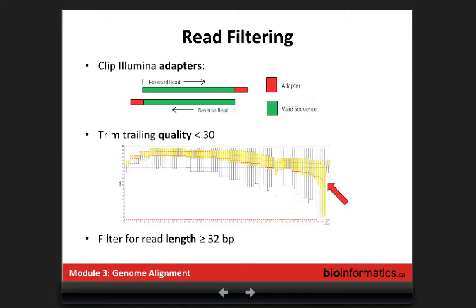I think you have a question? No? Okay. Now just to tell you, in the way we work, when we have good quality all over the sequence, which is the norm, it's really rare now that we have this pattern. We usually have something like that, where at the end we're around a level of 30. In that case, we don't do anything, because we now have aligners that are able to catch the adapter and soft clip it, so mark that part of the read as non-genomic DNA. Which is BWA-MEM, the one we would use during the practical.